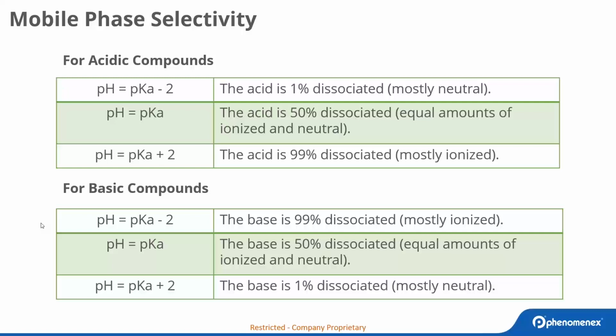There are always challenges that come with analytes that are partially ionized polar compounds in reverse phase chromatography. When a molecule is ionized, it is more polar and therefore more likely to participate in hydrogen bonding. In reverse phase with an aqueous mobile phase, the analyte will spend less time in hydrophobic interactions with the stationary phase and more time forming hydrogen bonds with the aqueous part of the mobile phase, compared to when that molecule is neutral.